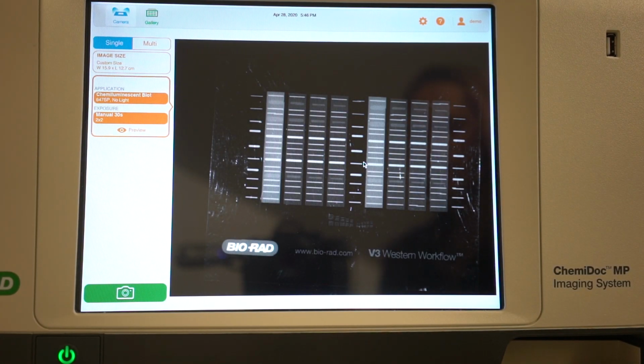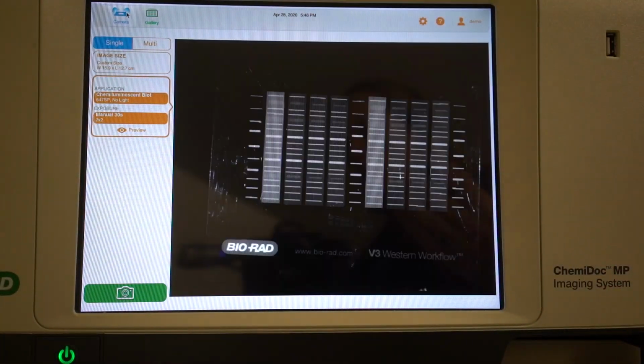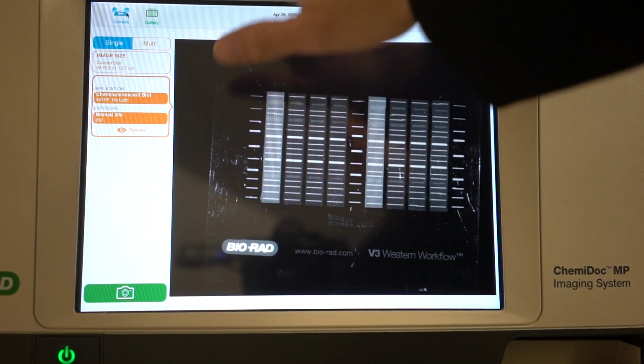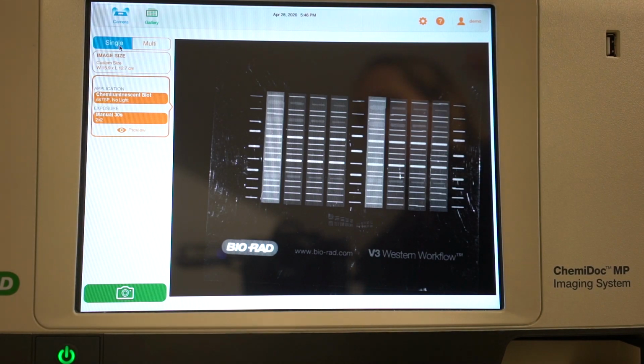Now I wanted to show you the touch screen a little bit closer. As you can see up here, we have a tab for camera and gallery. Camera is where you want to go when you want to take an image. Gallery is where you go to look at your images that have already been taken. Everything is automatically saved when you take an image, so you don't have to worry about saving any images. Now we just work down this screen here on the left-hand side. As you can see, we have the option for single or multi. So this instrument allows you to multiplex for your fluorescence blots, or you can choose single to take a single image.